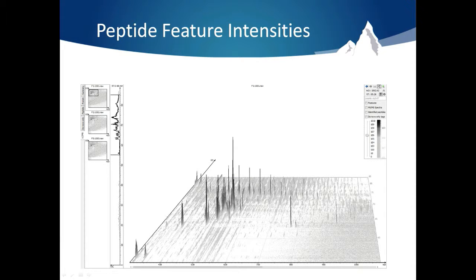Here you can see a graphical representation of a full proteomic LC-MS run. It's clear that there is a specific group of likely peptides represented by the high intensity peaks seen here. PEAKS then answers the question of what is the identity of those high intensity peptide signals.